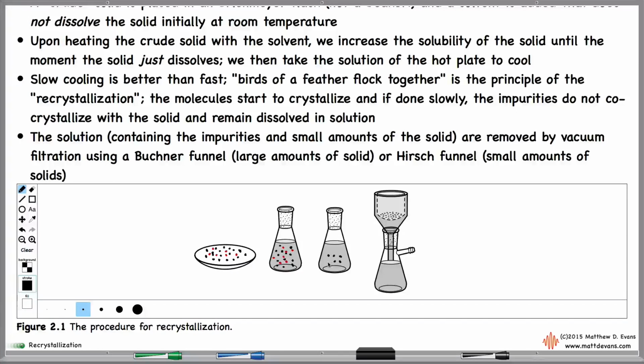very nicely. In fact, the very first compound you'll see in part A has got some really, really cool crystals. They're needle-like crystals, and that's a sign that they're highly pure at that point. If you could look at the crystal through a very powerful microscope, you're going to see that they're very well aligned. And you've got a crystal lattice structure, and everything's hunky-dory.